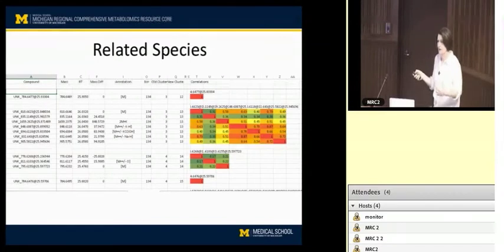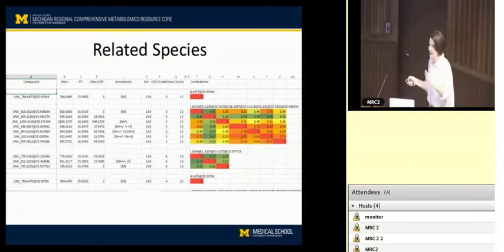If it's something plus a sodium and you're not telling the database that you're interested in something with sodium attached, it's never going to find it. But if you're looking at a neutral peak, there's a good chance you'll be able to make a database match to it.